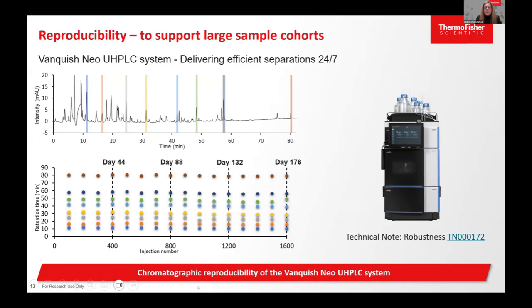And here is, for example, 1600 sample injections on a single column. And with the µPAC column or micropillar column, I used to run 5,000 injections on a single 50 centimeter column at 1 microliter flow rate. They're really robust, and you can get a whole cohort of a 2,000 sample study done on a single column.